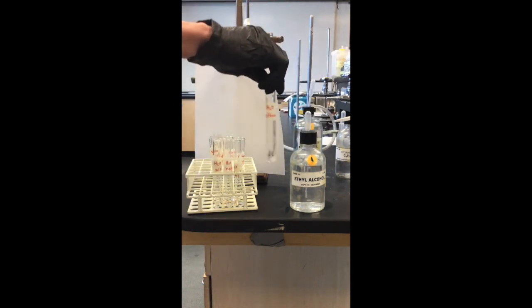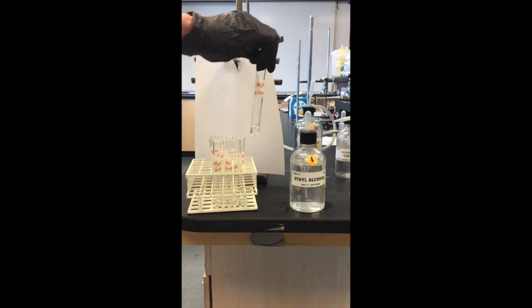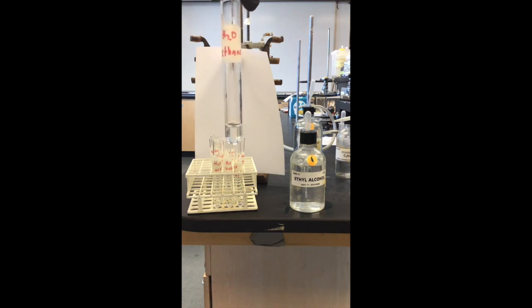And then you're going to go ahead and mix your solution up. And then you'll observe to see if it has 1 layer or 2 layers. So if it looks like it's completely mixed, we won't see a line separating my 2 layers, then we would say that my solution is miscible.